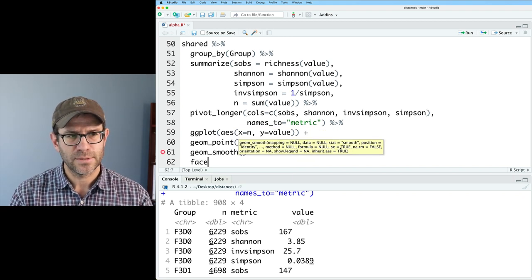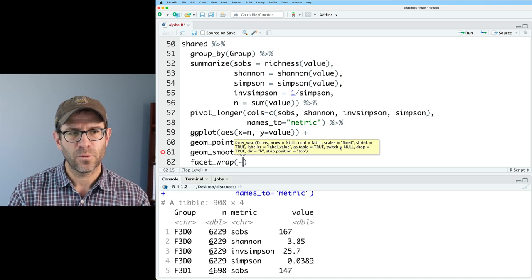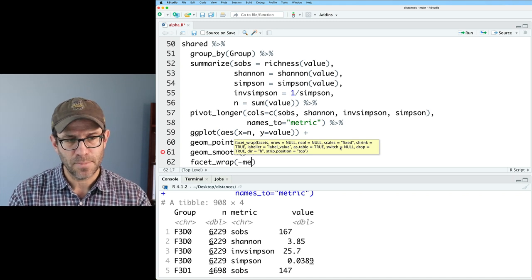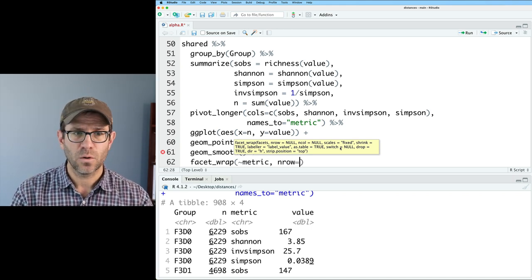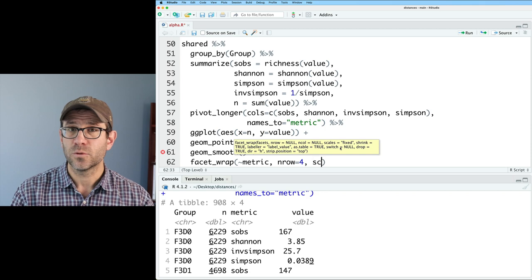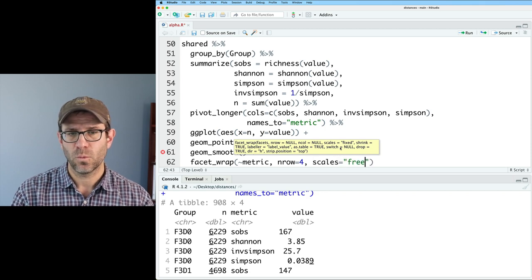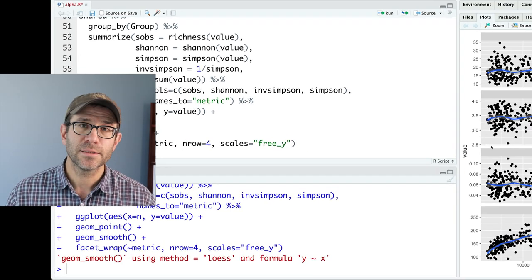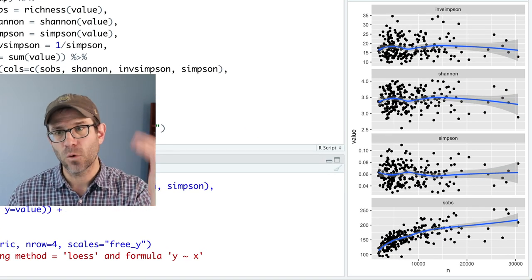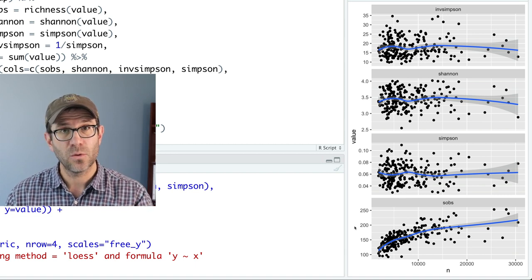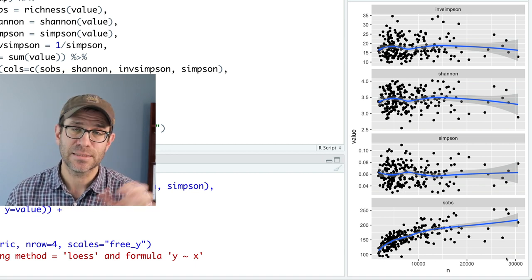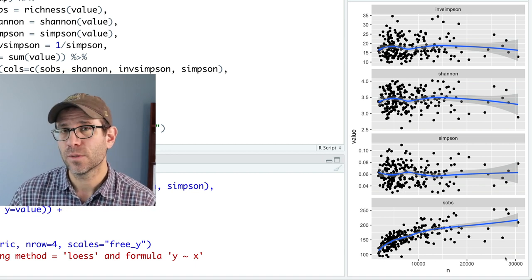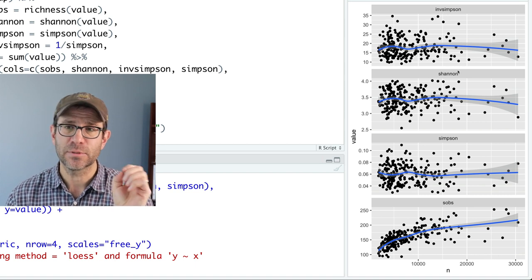And then we're going to do a facet wrap, where we'll facet on the metric, and we'll do n row equals four. And we'll do scales equals free y. And so what we get, of course, is our four metrics plotted with their value on the y axis. And on the x axis, the total number of sequences for each of those samples.